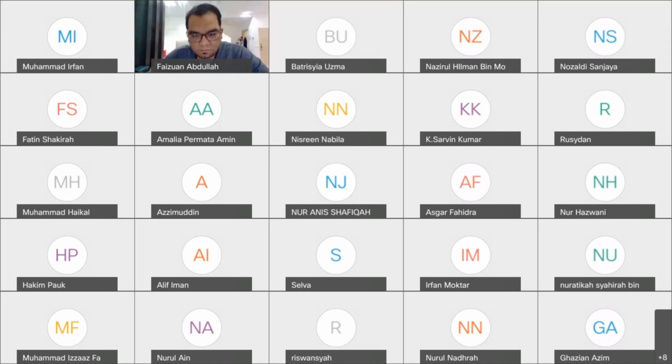All right, so today we're going to learn the last part of the chromatography topic, which is the use of organic analytes chromatography based method for calibration and validation. All right.